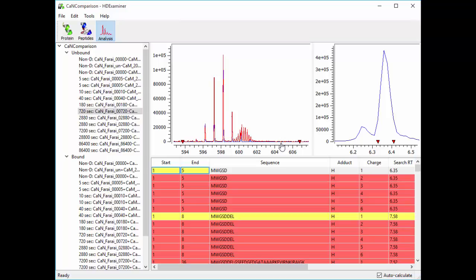The medium calculation will then find a peak in the extracted ion chromatogram, sum that up, and redo the calculation. What the complete algorithm does is after it finishes that, it will then start fiddling around with the retention time range. It will move it left, right, it will compress it a little, it will expand it a little, all in the search for a better result.